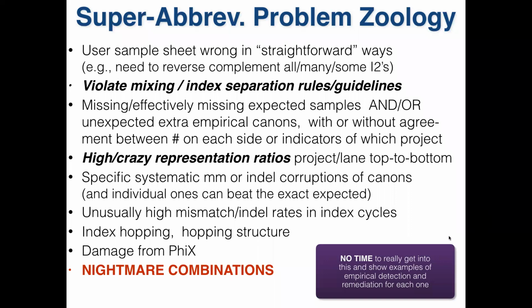So rather than take a lot of time to do examples for all these and so on, I'm sort of arguing for authority because I haven't shown you the evidence. I was saying that I've actually demuxed all 600 lanes and I've seen these things, but if I had to, I'd consider the real evidence. But maybe from the procedure of empirical discovery that we showed you the outlines of the first day, you can at least believe how you can come to the point of discovering these things. So here are basically the major classes.